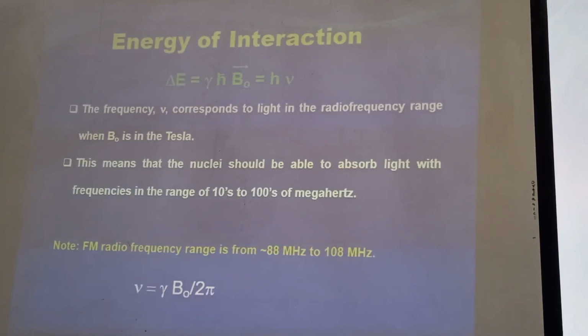When you tune your radio receiver to exactly the same frequency at which your channel is transmitting, then you will be able to hear the songs or the news or whatever programs are being transmitted. If you deviate from that frequency, resonance will not take place and you will hear just the noise.